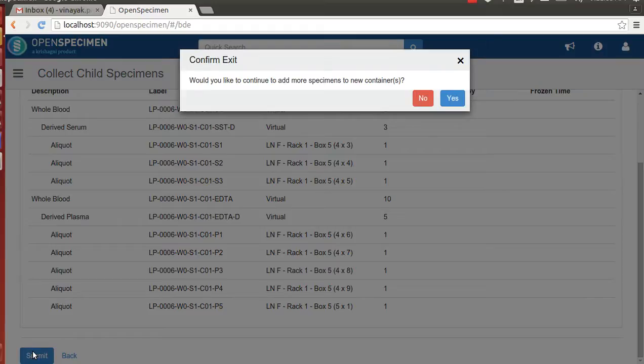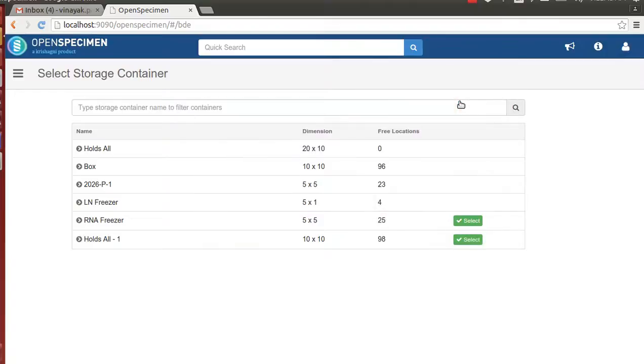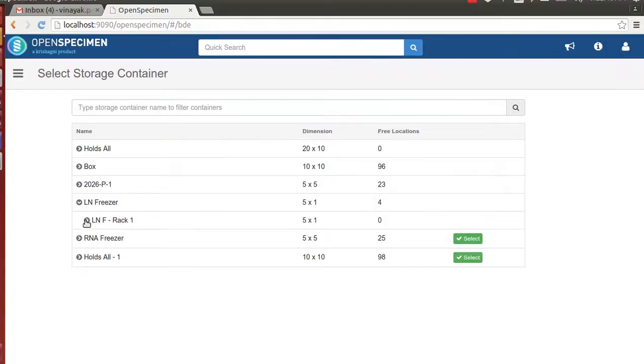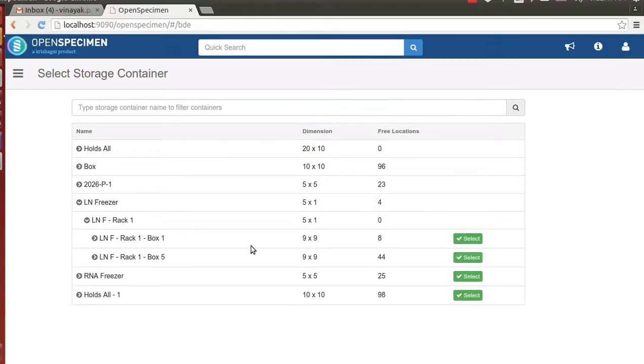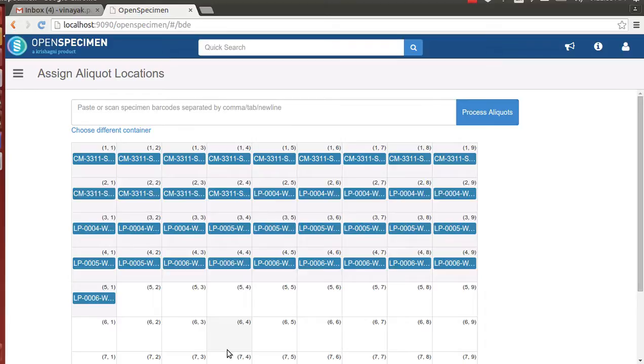At this step, the technician can assign more positions. Since we assign positions for only first patient aliquots, we will say yes and assign position to second patient aliquots as well. Now, as you can see, the positions have been occupied by the first patient aliquots.